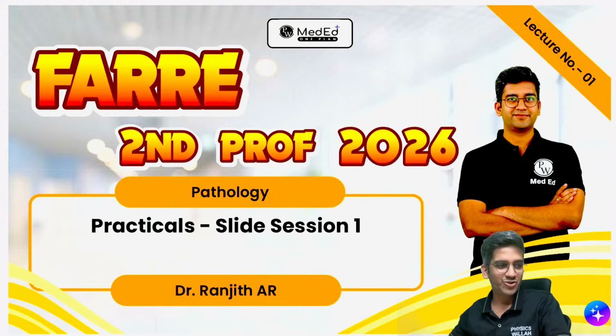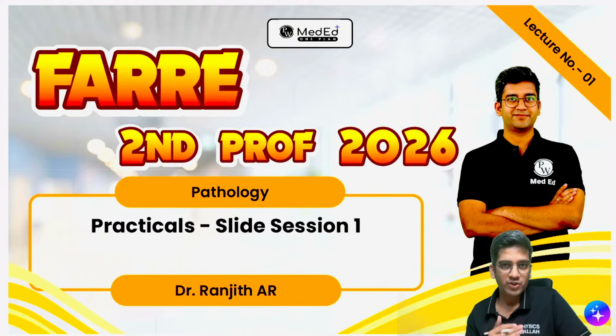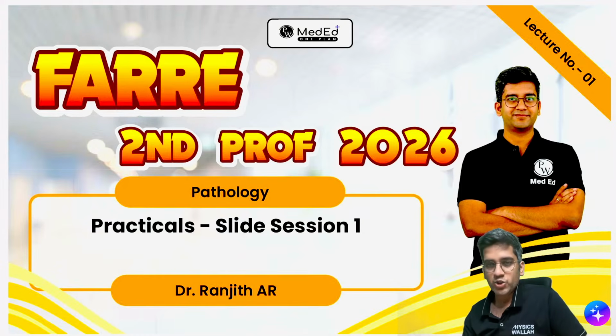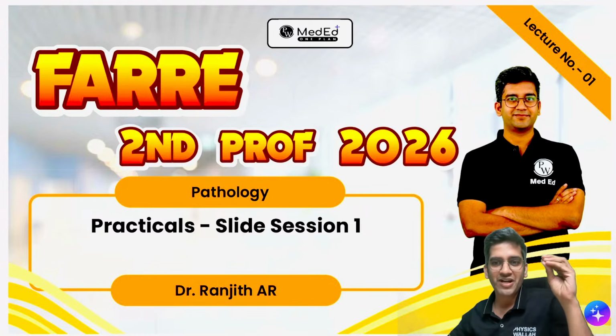I know I still have to take endocrine and skin and GIT. I'll definitely take that. Since you've completed your microbiology practicals and pathology practicals, what we thought is we will take time to look at the slides, right? In my YouTube channel, I have put a few gross images and how to answer them for Viva, and this is for slides.